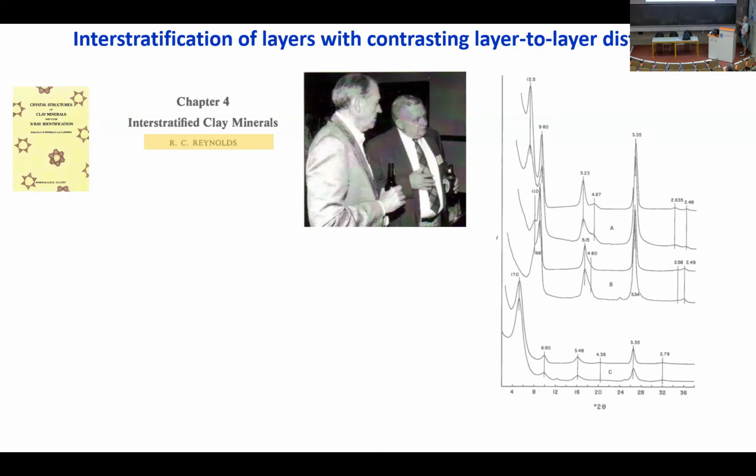You have peaks that clearly do not have the same shape or profile as what they measured, etc. But at least they were honest enough to say, this is what I have measured, this is what I think I have in my sample, and here is the comparison. And they show it.